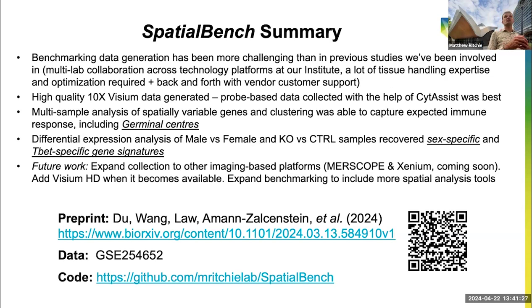What I really like about this data is that we've tried to make a replicate collection where we've got biological replicates in our different groups, and tried to work out how you would go through that and make a sensible analysis using existing tools. As I mentioned, nnSVG and iSC.MEB have multi-sample modes that you can turn on to say, right, I've got a bunch of samples here and a bunch of samples here, so it might be useful to analyze them as a whole rather than as an individual sample, which is what some methods rely on.